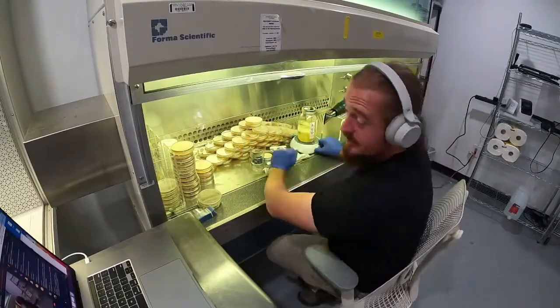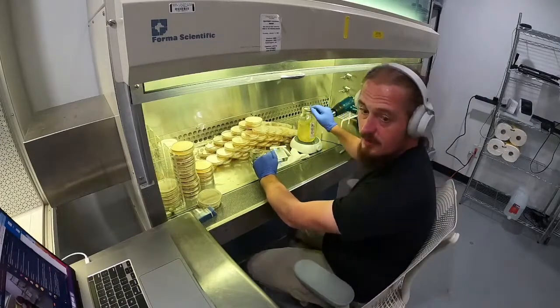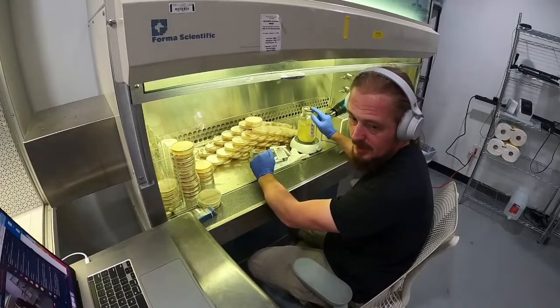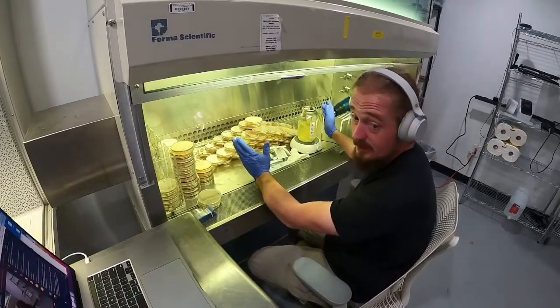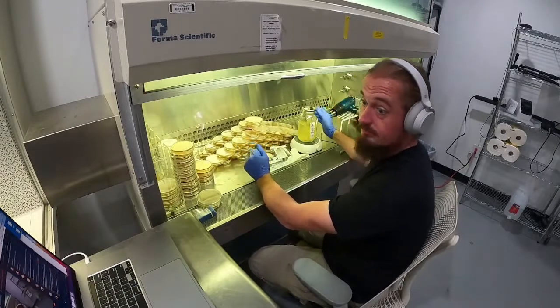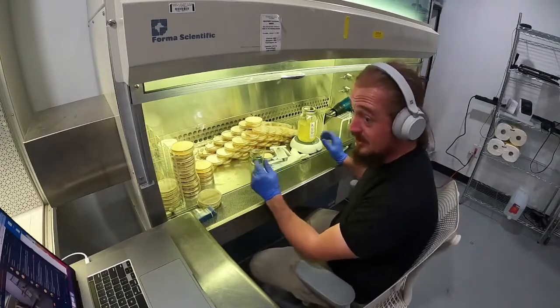A lot of the equipment that we use, I get fewer uses out of metal lids than I do the plastic BPA-free lids, because the plastic ones ain't going to rust. Yeah, it's straight up rust.